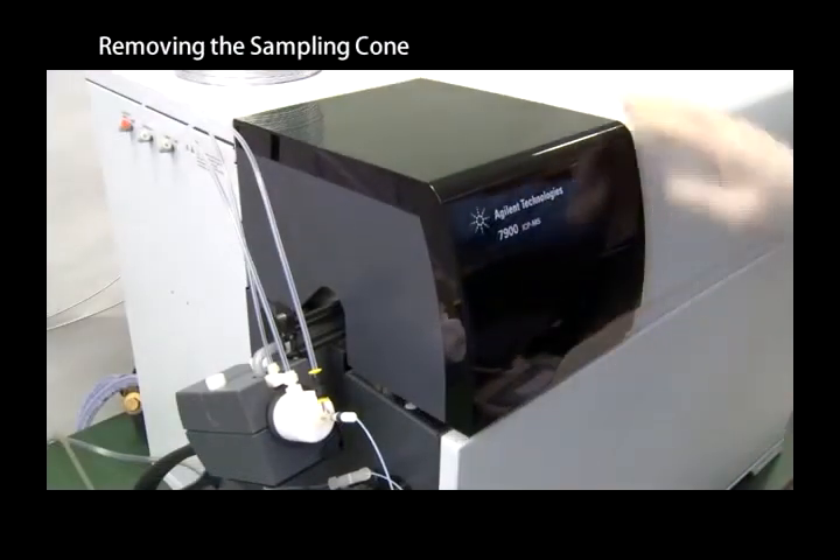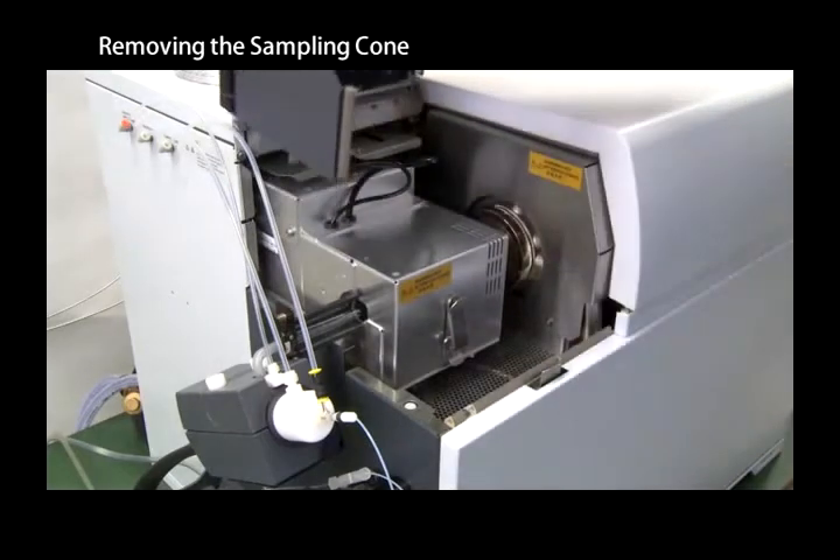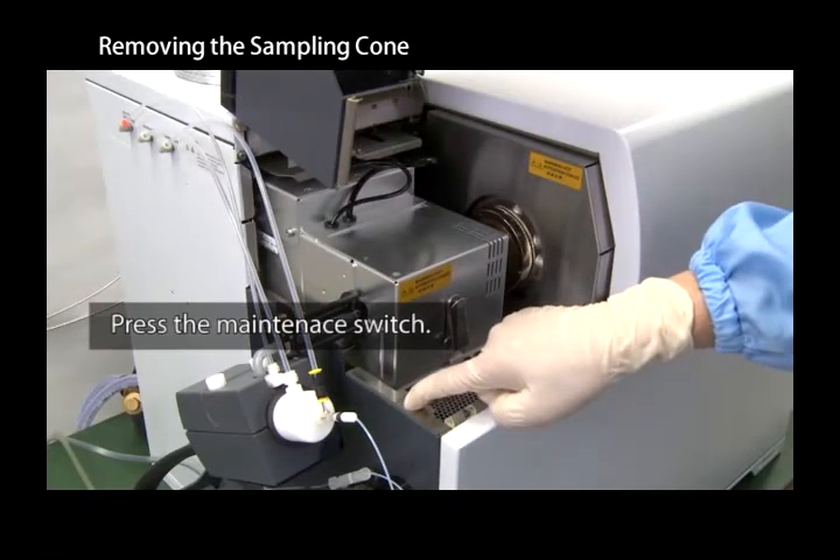Open the top cover on the left side of the instrument. Press the maintenance switch to move the torch box into the maintenance position.